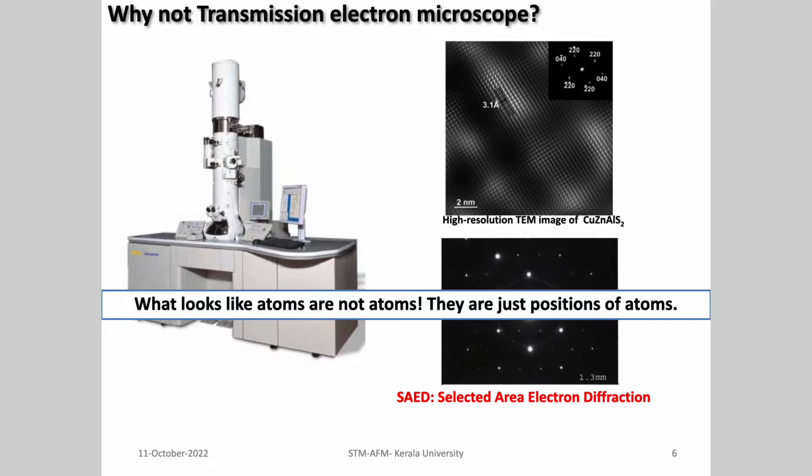It's basically from graphene or graphite. Okay, so you see, hexagonal structure means that the crystal also has a hexagonal structure. Now, what people do is they take this diffraction image and do an inverse Fourier transform. Then what they get is the grating which gave this diffraction pattern. So basically, it is a crystal which gave the diffraction pattern. So you get back the grating.